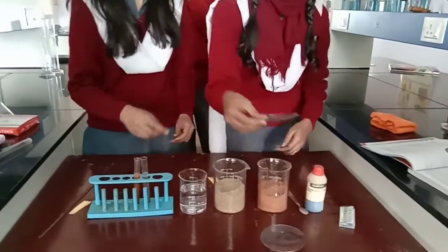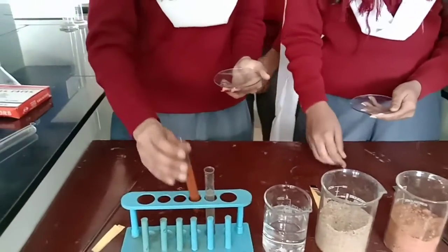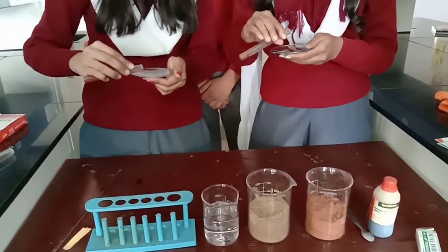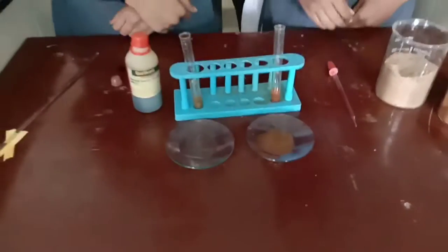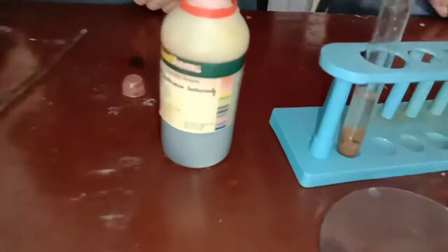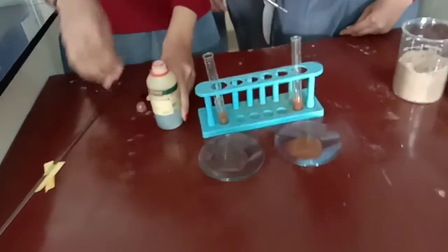There is one more, an alternative way of checking the pH of our soil sample. We'll pour the water from our test tubes into this watch glass like this. After that, we'll take the universal pH indicator solution here.